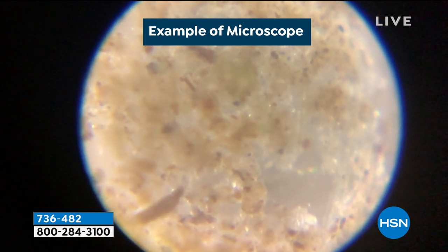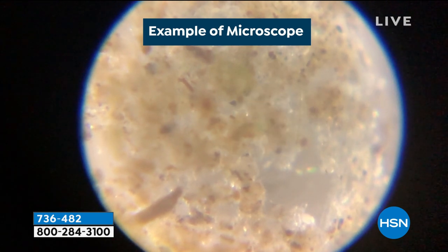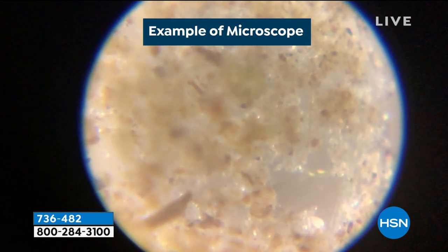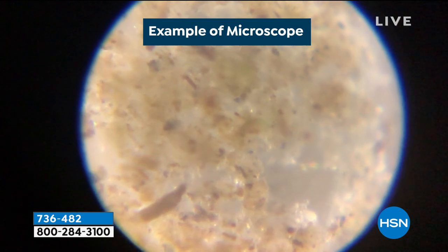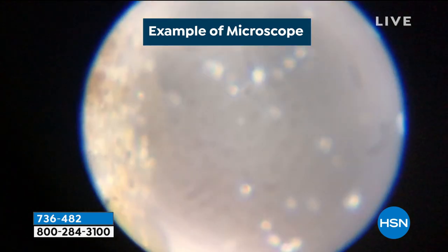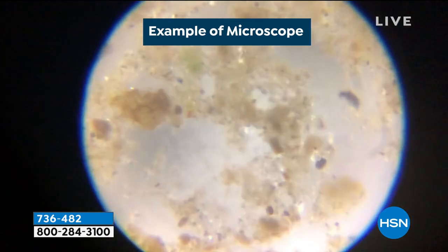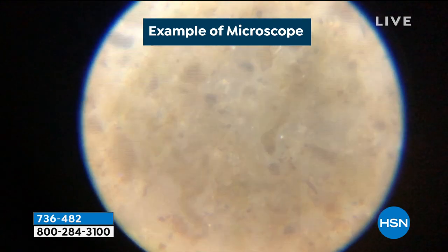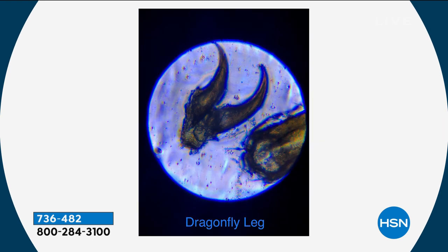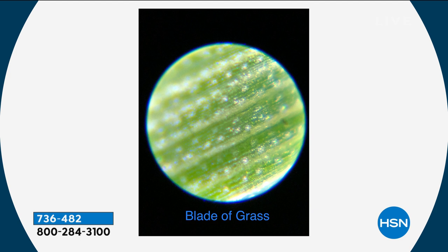Yeah, and you're looking at what looks to be some sort of a larvae, I would believe. Or would that be larva? I think it looks like that. Yeah, so I think that might even be pond water. Believe it or not. I think there's a sample of pond water and you're just seeing the microorganisms moving around in there. Doug, I remember the first slide we ever looked at. It was that caddisfly larvae from a pond. That must have been what all kids looked at because we took a school trip, went to a pond, took water out, brought it back. We put them on slides and we're like, oh my gosh, it's really a kid's first experience with what I would call micro nature. You know what I mean? Because there's no other way to look at this unless you look at it under a microscope.